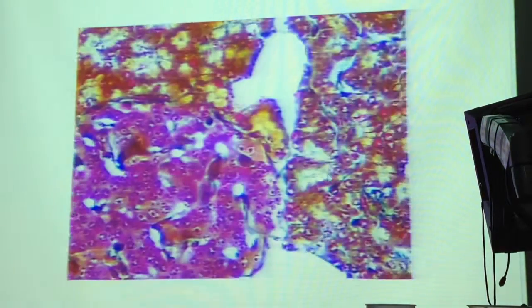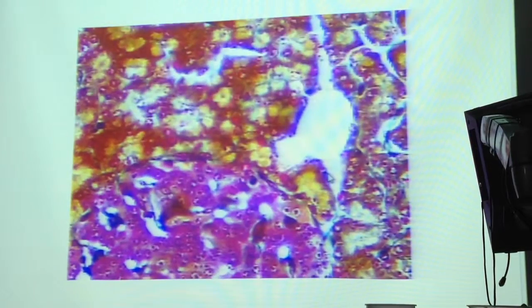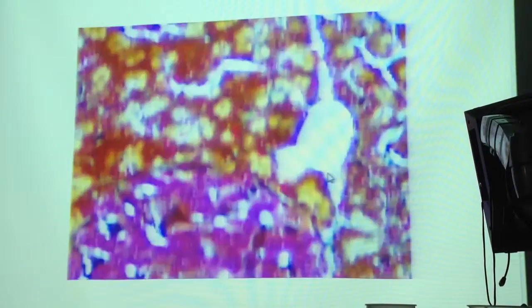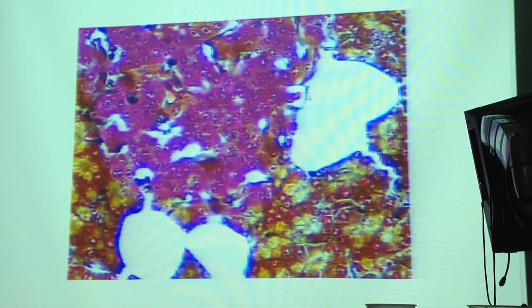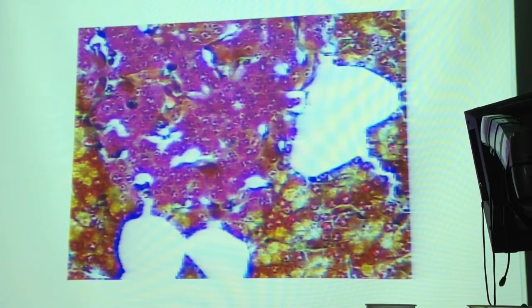These yellow-brown cells that make up most of the tissue, again, are the exocrine cells that for the most part produce digestive enzymes. And they're carried by pancreatic ducts to the small intestine. And there are two major ducts. One that basically runs the length of the pancreas. What's that called? The main pancreatic duct. Okay, it's got a fancy name, but I accept main pancreatic duct.